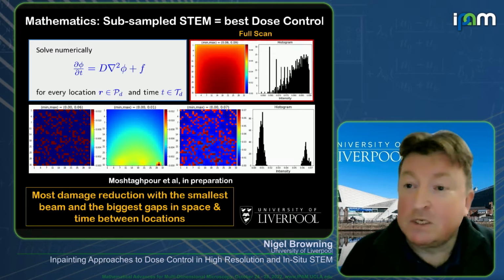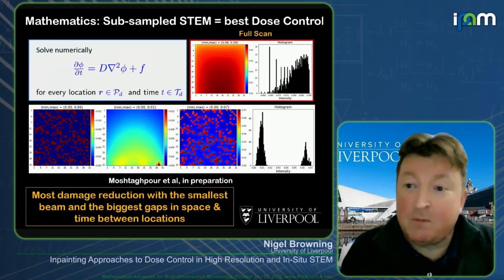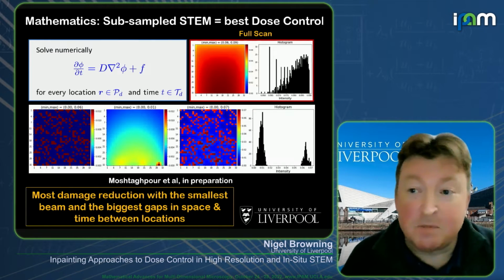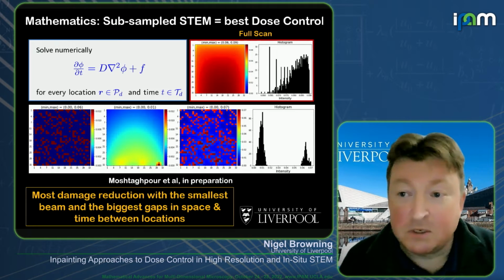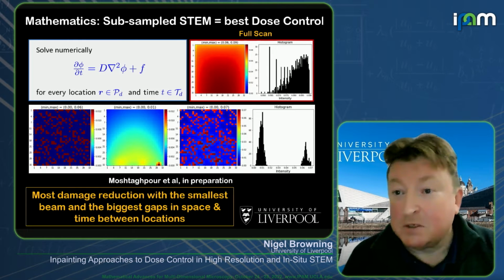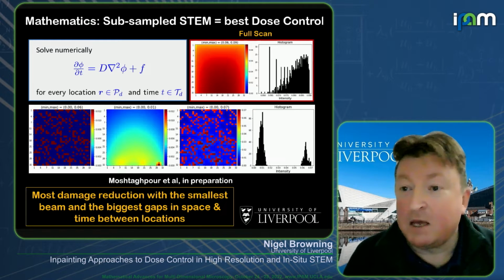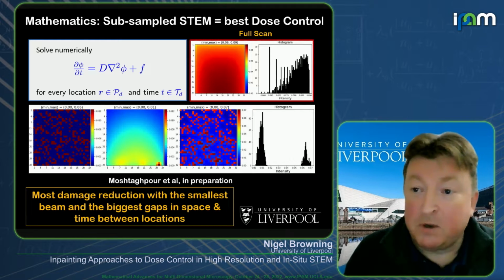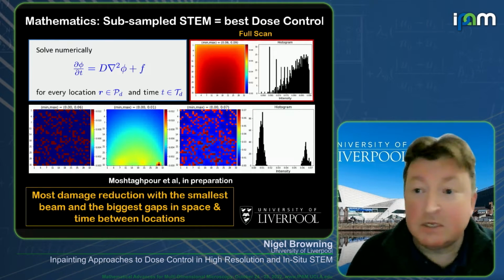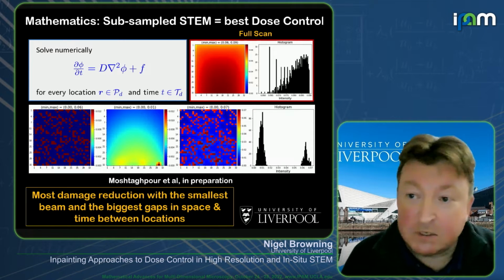If we have something that we would say is beam tolerant, then what that's saying is the rate of the diffusion of the damage is much slower, and so we can basically get to that point where we're not creating as many damage effects and they're not diffusing as quickly. Now, what this gets down to is basically two numerical factors that you can put into a differential equation to work out what the effect of damage is. And you don't really, at this point, need to know whether it's ionization damage, whether it's knock-on damage. It's just a damage effect that's taking place that will be diffusing away from the point of incidence where the beam is.